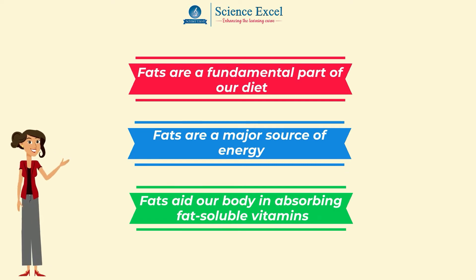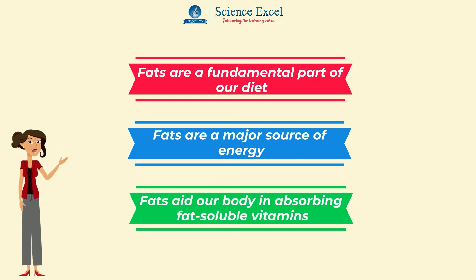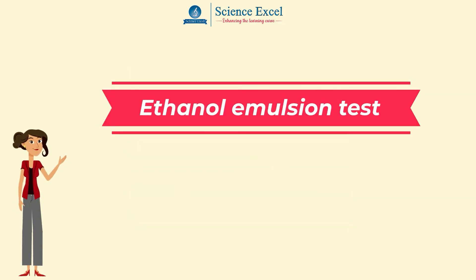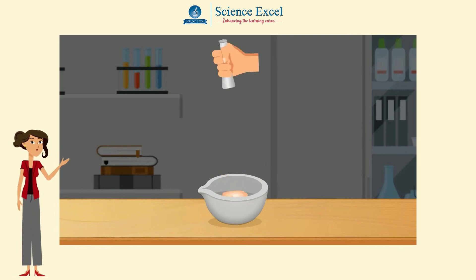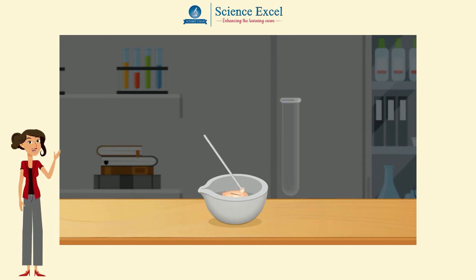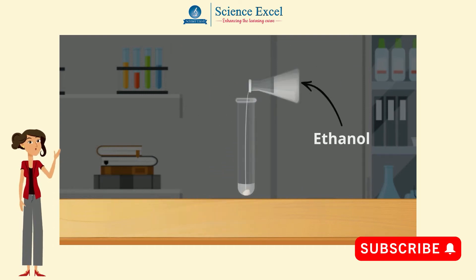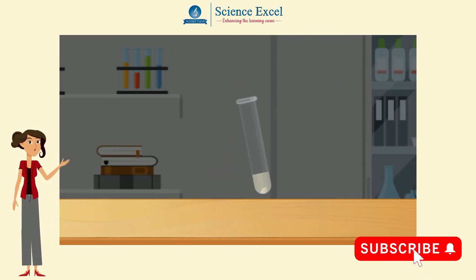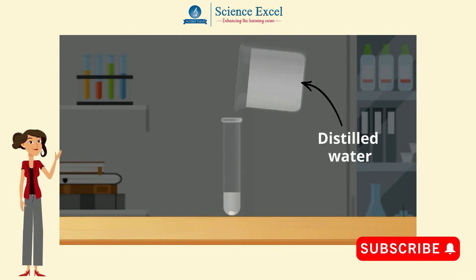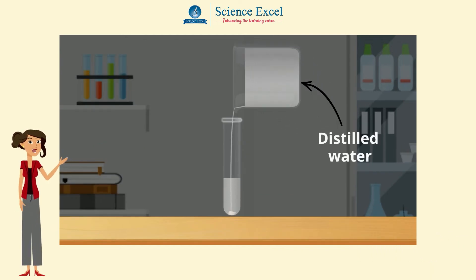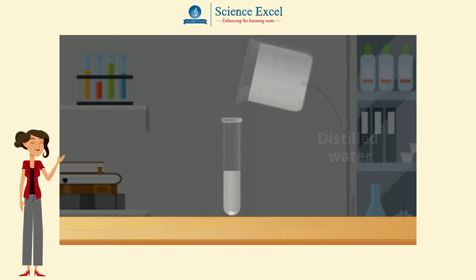There are several different tests for fats. One of the best is the ethanol emulsion test. Cut or grind a little food. Pour ethanol into it and shake the test tube thoroughly. Add some distilled water to make the test tube half full.